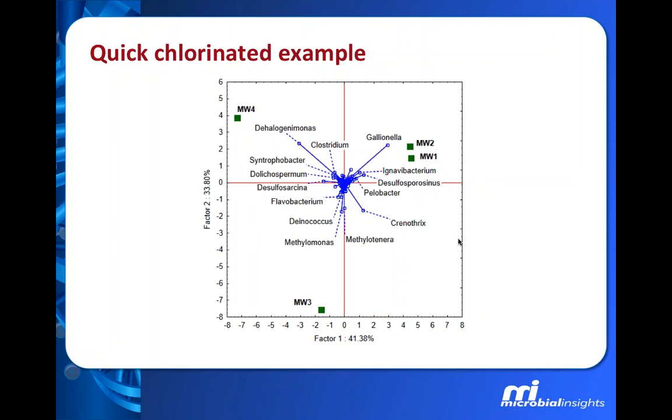And I don't have time to run through the detail like I did, but we can see from the microbial community, if we go through the data, that we can link how our microbial community is being pulled from these 4 different monitoring wells shown here into deep and shallow locations. And we can also see at these locations differences in our contaminant, chlorinated ethenes and chlorinated benzenes. These seem to be the biggest differentiating factors in our location and our contaminant as to causing the differences in these microbial communities.